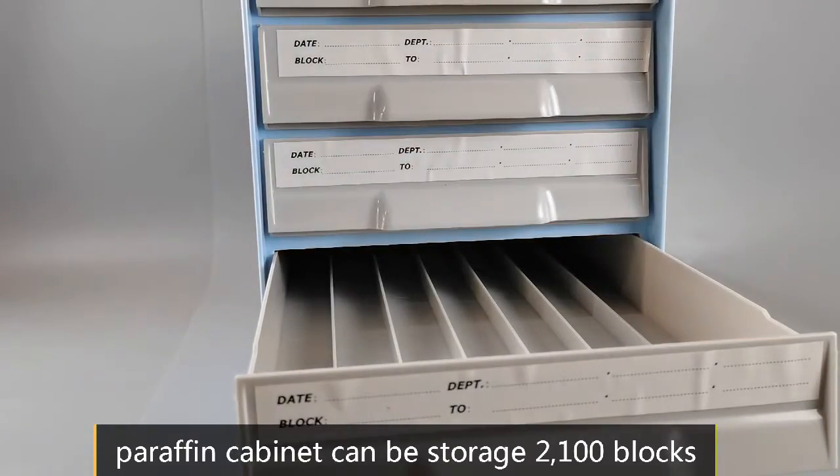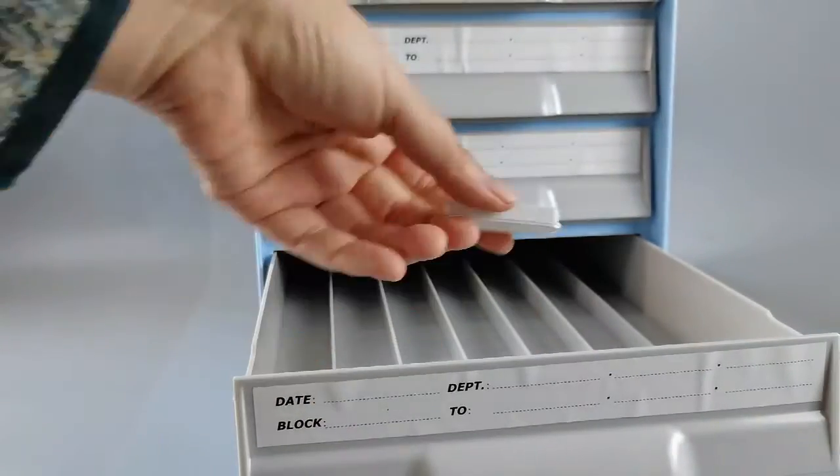All the units are stackable with a built-in locking system for safely storing more blocks.